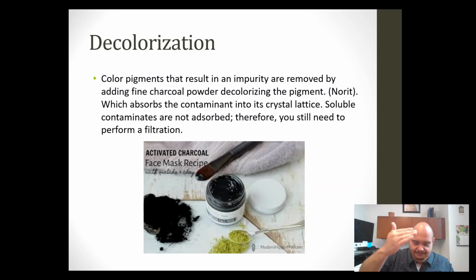Separate out the impurities with the solvent. Take your crystal cake, dry it. If you see any color or anything that looks a little bit abnormal, like, oh, it looks like a little brown thing there, take some ice cold ethanol with a medicine dropper, drop that onto the filtered cake and try to wash the impurities down to make sure that there's nothing on the surface of the crystal. Wash those impurities back down, and then you can take your crystal, dry it, run a melting point, and try to identify what it is, or at least confirm what it is if you already know it's sulfanilamide.